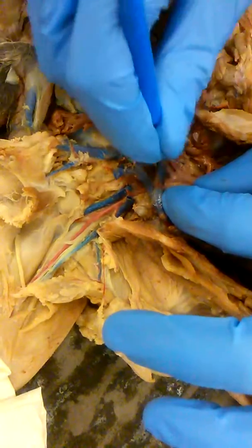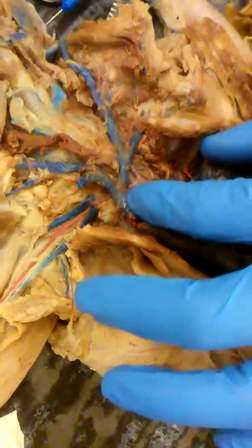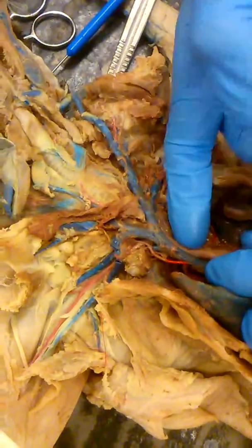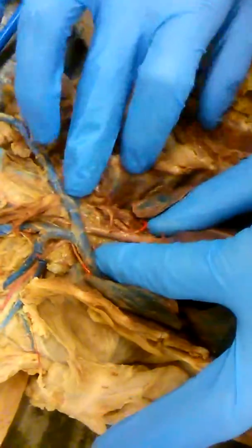The aorta was that thing on top, right? Yep. Okay, so on humans, we have like the 3 that come off our aorta. On cats, they only have those 2 main vessels. So the first one, right here, is your brachiocephalic.